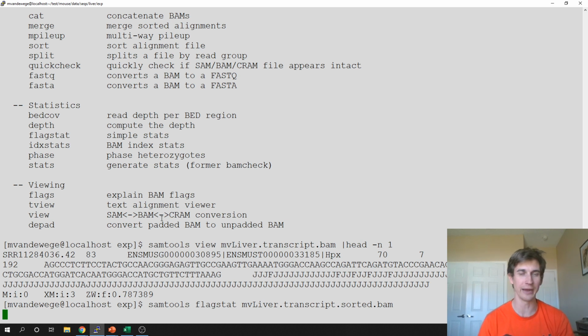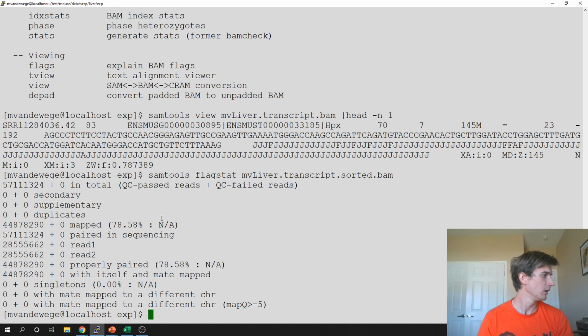So I uploaded an assignment that basically says the second part of it is to download R if you don't already have it, and install RStudio. And so we'll explore R and RStudio for the rest of the semester. We really won't be on the server that much from here on. All right, so this is done.